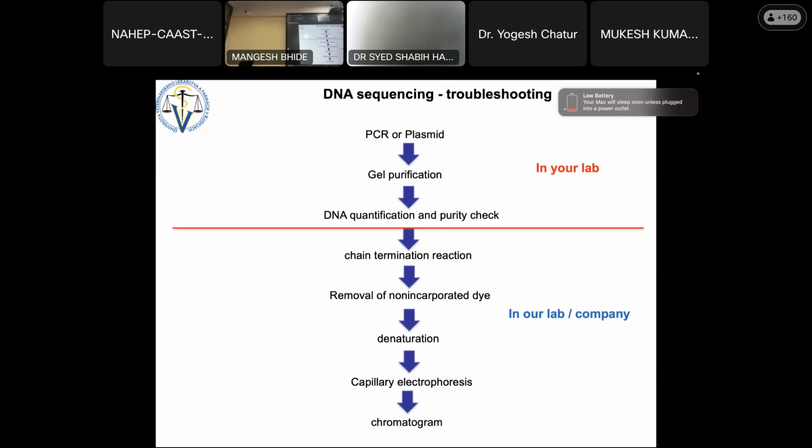In the case of multiplex PCR, first you put it on the gel and then cut from the gel, separate on the gel.